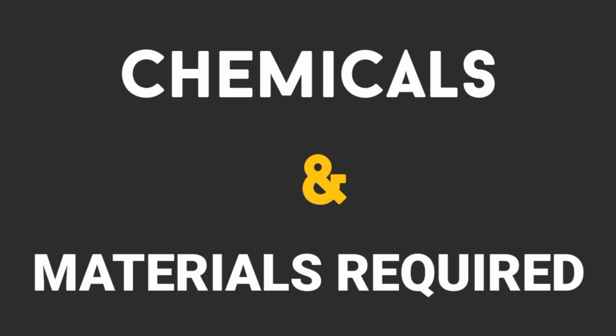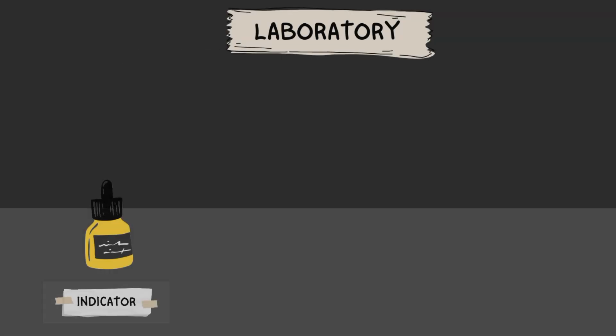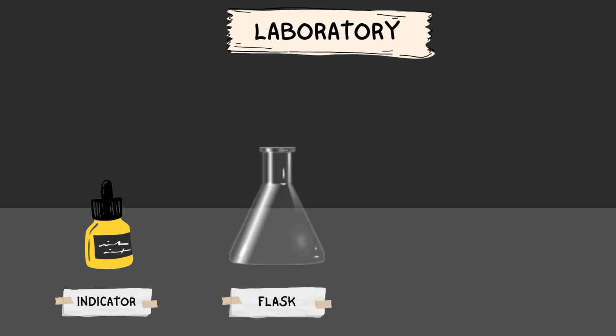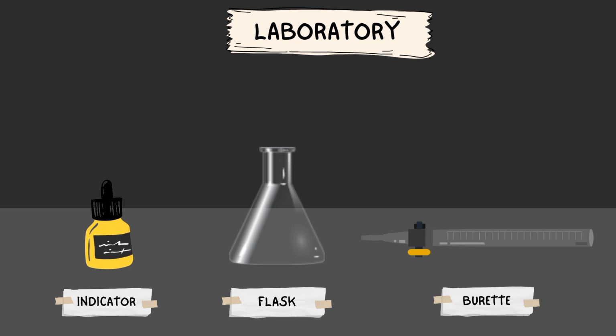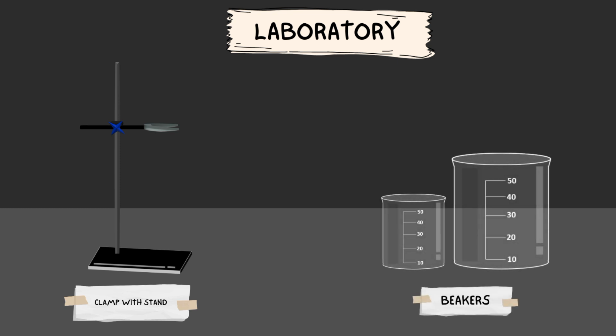Chemicals and materials required. An indicator, a flask, a burette, clamp with stand, beakers.